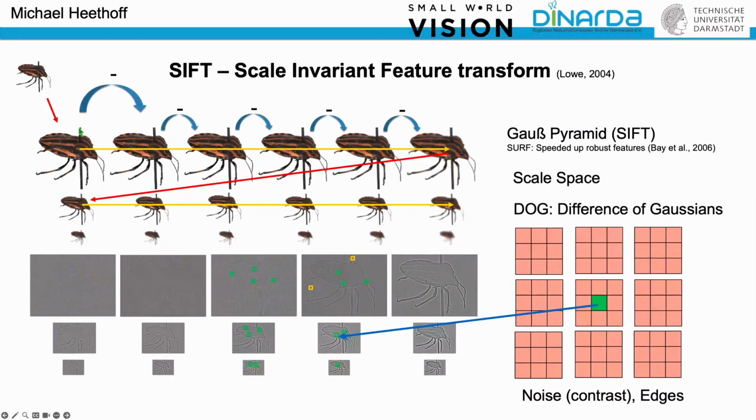We want to extract from that object special features that might help us identify parts of the object. To make this a little clearer, for example, when you're on a hike and you see a tree standing away 200, 300 meters, you will immediately say that's a tree. You will use characters that your brain uses to identify this as a tree.